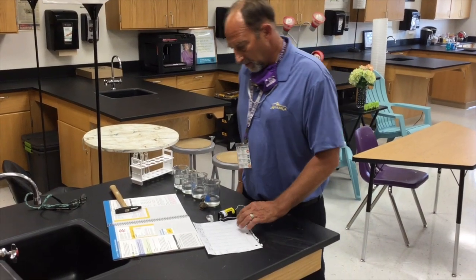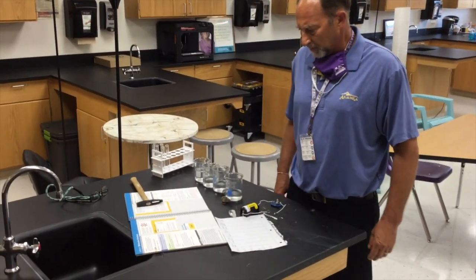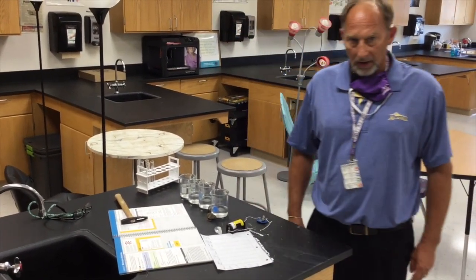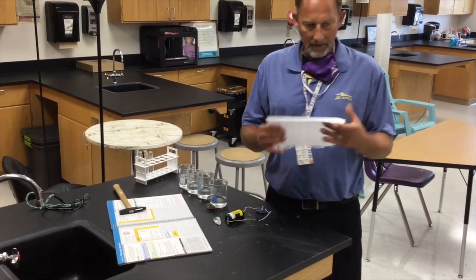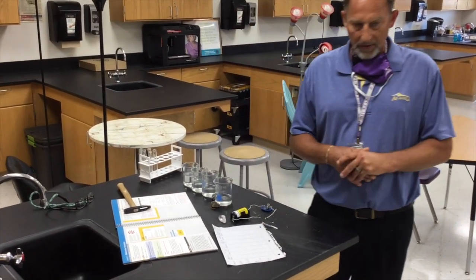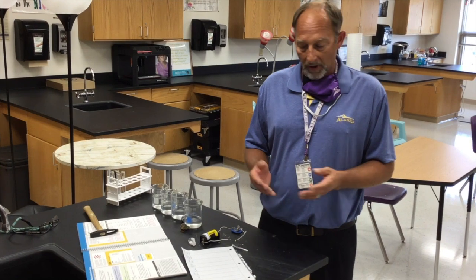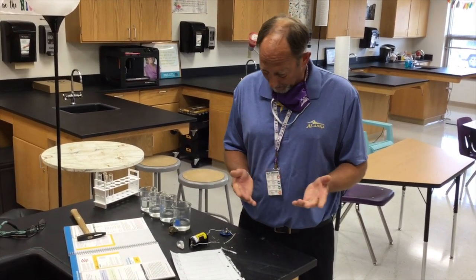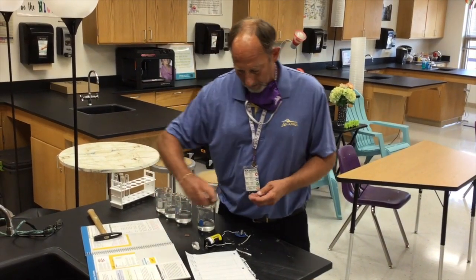Alright, today we're looking at slide 15, I believe, and the lab is called Comparing Compounds. And we saw the directions. You have seen a picture of our data table. And if you remember, we had a short lab demonstration on elements a day or two ago on carbon and sulfur. Today we're doing a similar lab on compounds. Remember, you need to know the difference between an element and a compound. Today we have 4 compounds we're going to run through our little activity.